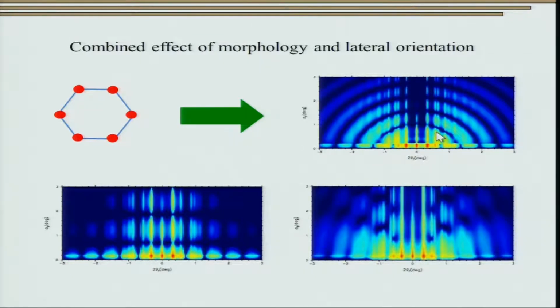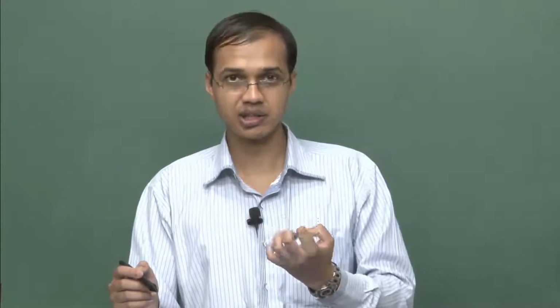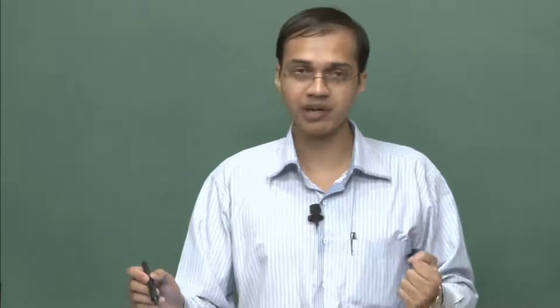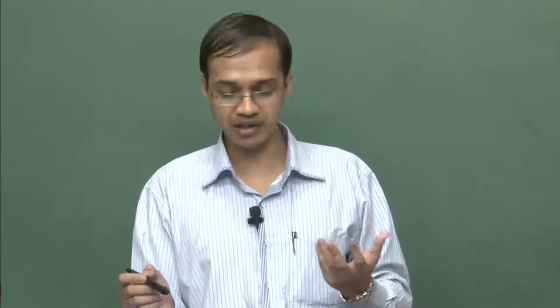So, therefore, there is a superposition of these two things and we do get a very different pattern, right. Now, this form factor, I hope you appreciate that once you get your experimental pattern, what we need to do is assume shapes or make a first guess, do simulations and get a good match between the experimental and simulated pattern to comment something about the size and shape of the particle.